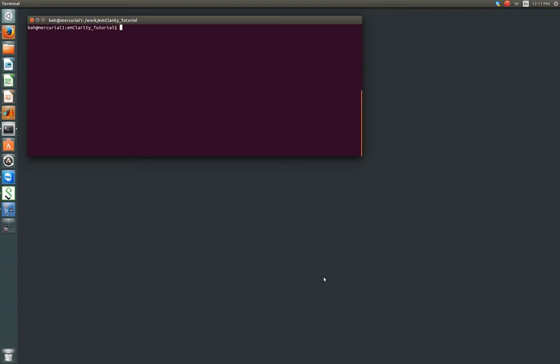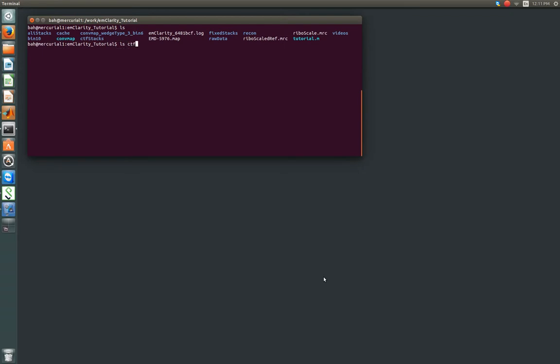Alright, so we've now finished the CTF correction, which we see the results show up in this directory called CTF Stacks. And again, I only ran it for Tilt Series 1, you'll have Tilt 1 and Tilt 2. And you notice in addition to the Li1, we now have a CTF tossed in there before the dot fixed.